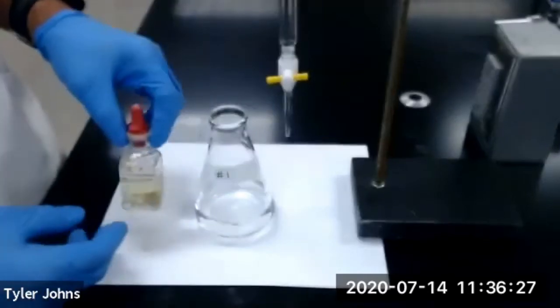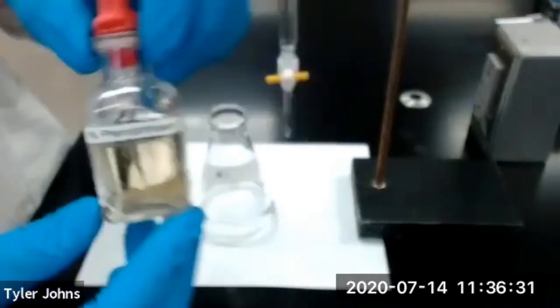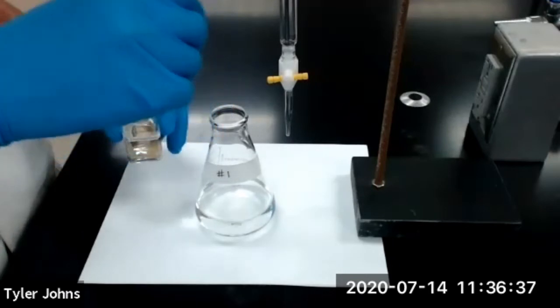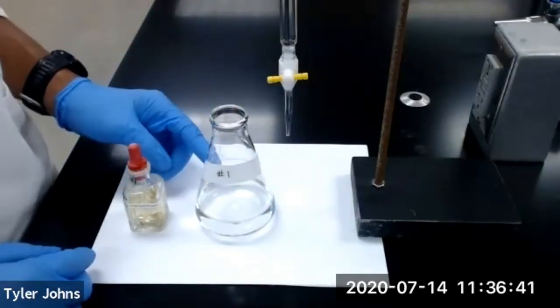We next need to add 3 drops of our 1% phenolphthalein indicator to our Erlenmeyer flask, and we will then titrate to a faint pink endpoint.